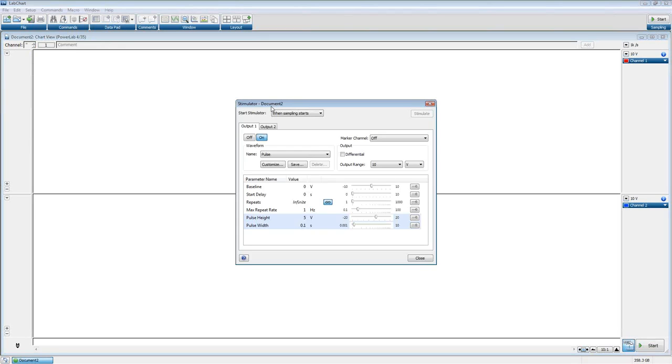So that covers the basics of the stimulator. Preloaded things, very straightforward stuff to do. You're not getting too deep into a lot of the power of the stimulator, but very rudimentary. You can use this just straight away. There's no real learning curve for this.